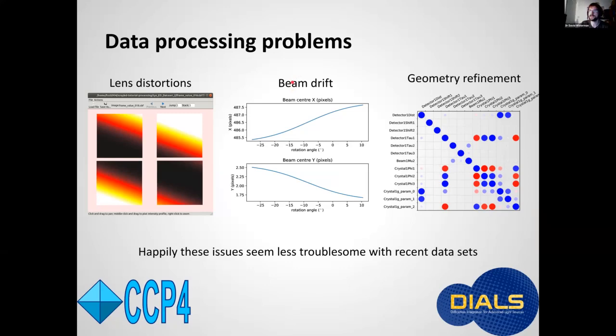Second thing is that the beam can drift during the experiment. So we had to add a way to model that. We added a way to model it globally with a smoothly varying function. For this data set, we saw that the beam drifted by about one or two pixels in each direction, which is not a huge amount, but correcting this does improve the integration results.